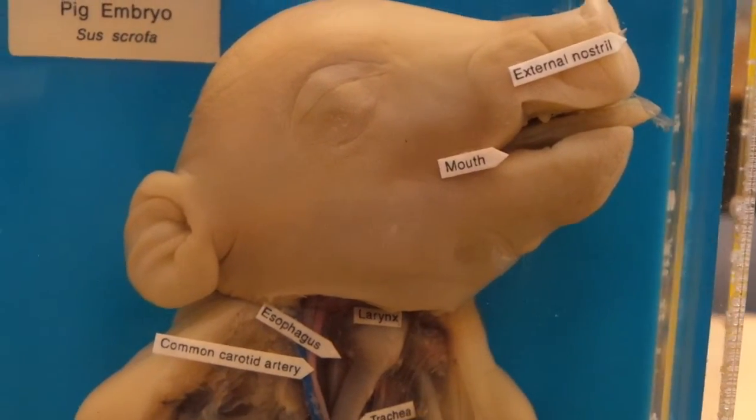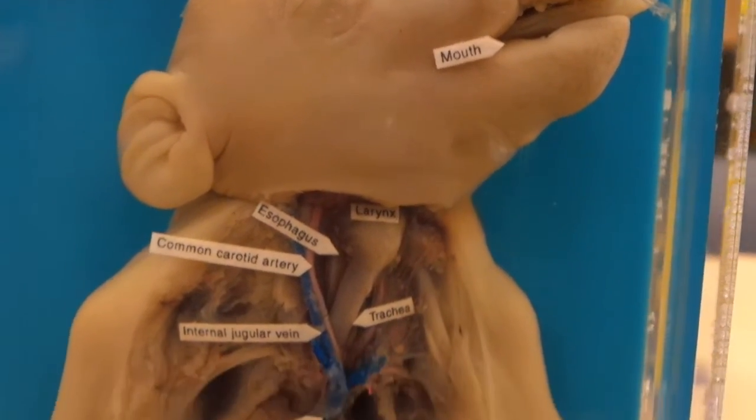Alright guys, a lot of you are freaking out because you're going to have the fetal pig on your exam. However, here he is, on all labels.